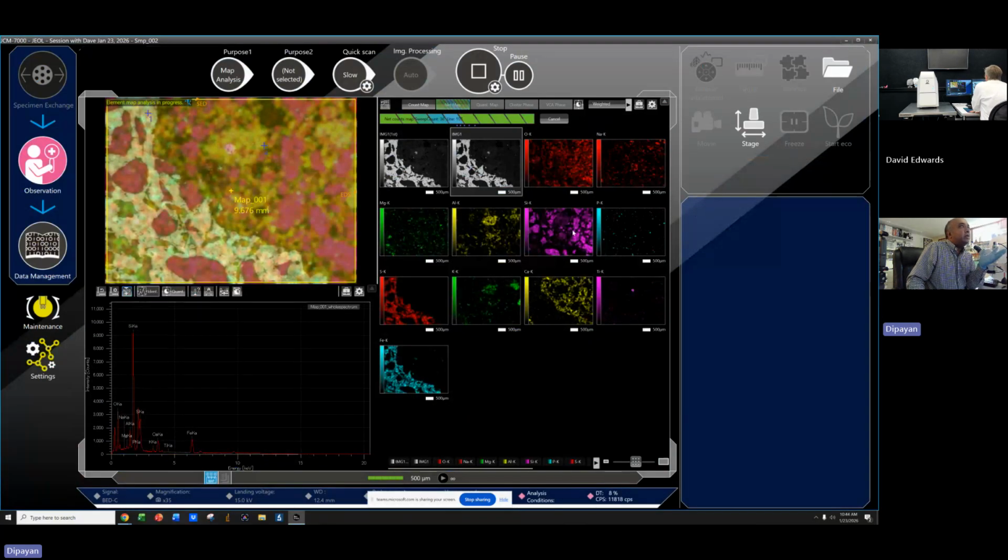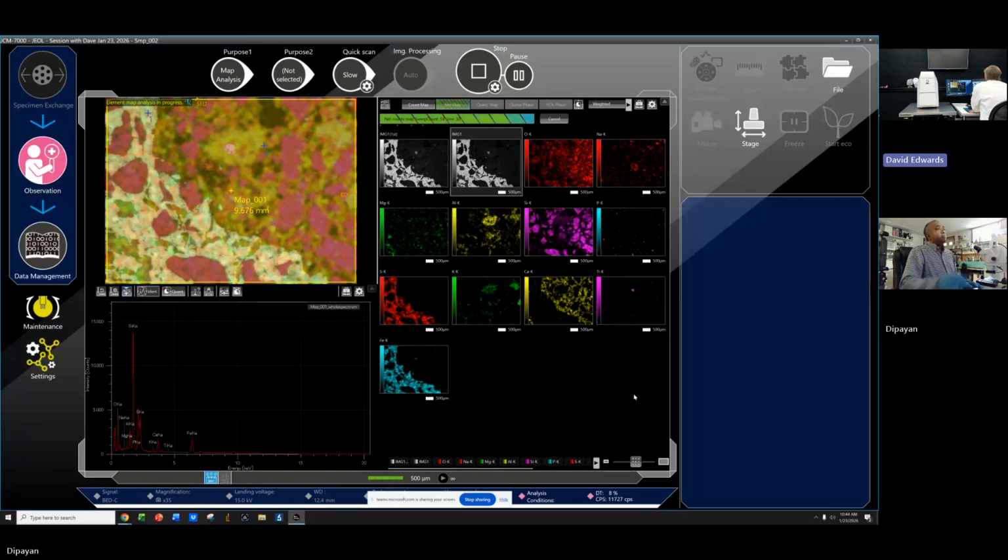But how do I know which color I want unless I see? Because that's a permutation combination I have to do. First of all, is there a way I can force it not to give the same color for two elements? Nope. Right now, if you use the auto, it's just going to cycle the same 5 colors. So as soon as you hit 6 elements, you're going to have a copy of a color. So the only way to do that is to create your own color. Okay, I see.